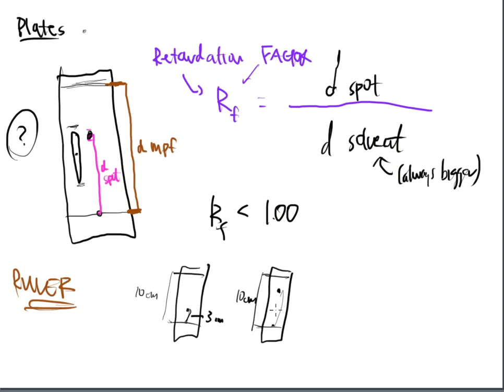And then over here, this spot traveled more. That means it's not hanging out with the stationary phase. That means it's not hanging out with the silica and the alumina. That means it's not probably polar. It's more non-polar in nature compared to the first one at least. And this one traveled up further, and let's say that this one went up 8 centimeters. Typically, I measure in centimeters.